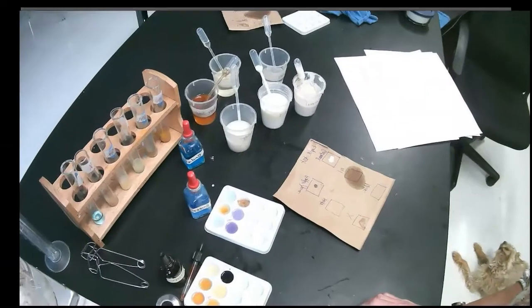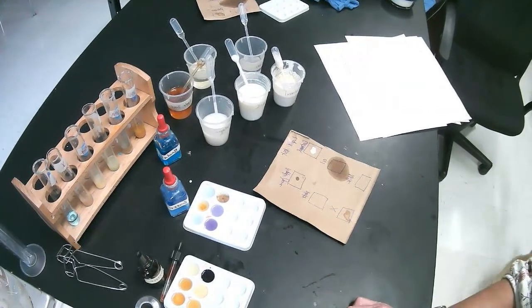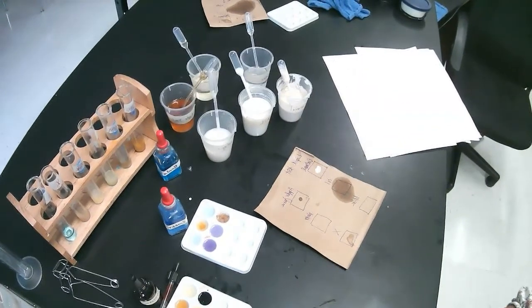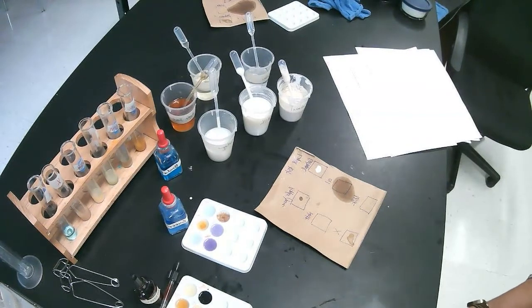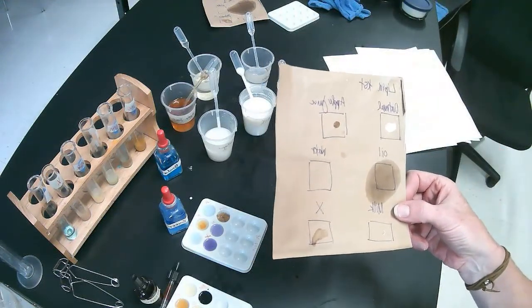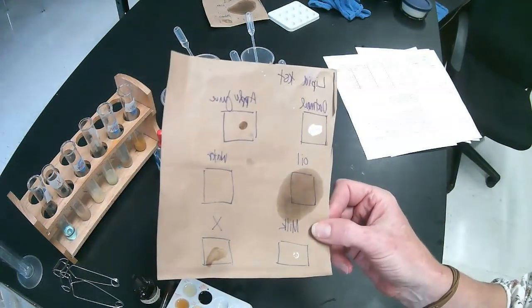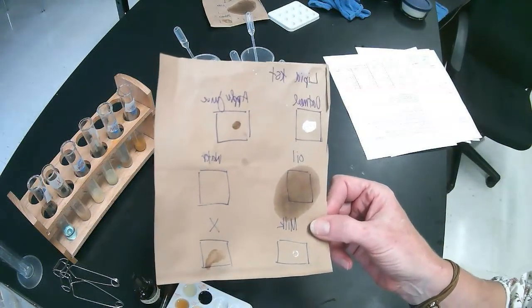Let me blow this up. Okay. Hope that's a little bit better. Yes, hi Daisy. Okay. All right. So the first test that we'll go through is the lipid test. So again, make sure you are on that results table on your pre-lab worksheet. Okay. So the lipid test that we did, not the Sudan test, and that is on there. Oh, loving the backwards. Man, I thought I'd told it to flip.